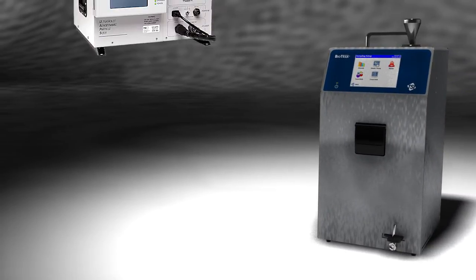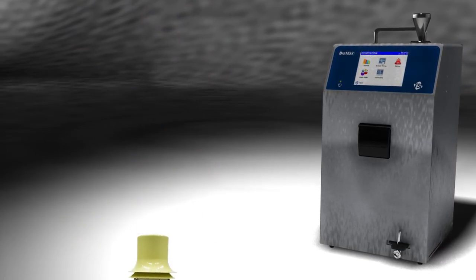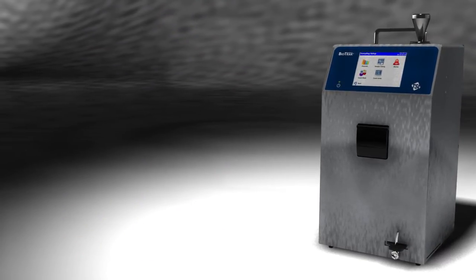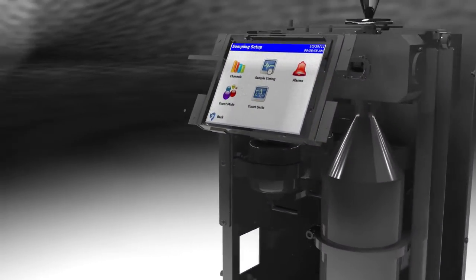Building on TSI's decades of experience in biological particle detection for military applications, the Biotrek utilizes laser-induced fluorescence to analyze each particle, resulting in real-time viable measurements.